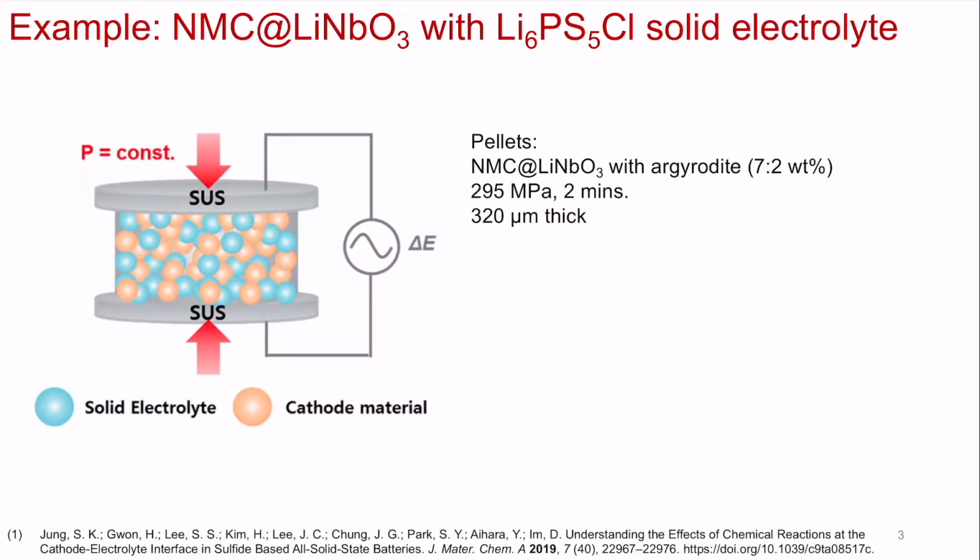And so the typical experiments for all of these types of studies would be to make your composite and then to compare it with the bare electrode material or composite. And typically you need to do this under pressure, either to maintain the contact, but it also allows you to mimic how this material would behave in a real life battery, because typically battery packs are pressurized before they go into the electric vehicle. Now, this is just a symmetric cell, so you're isolating all of the components. You haven't made a full cell just yet.